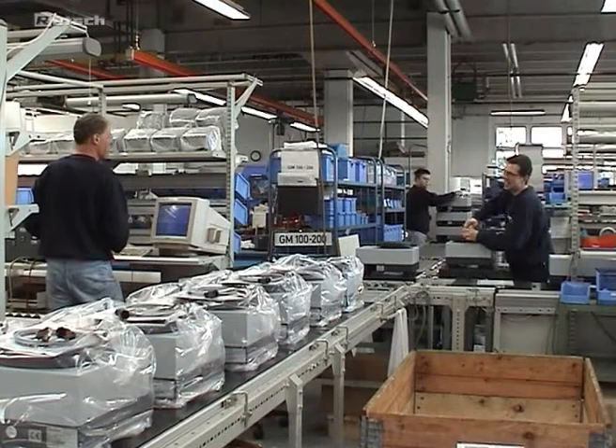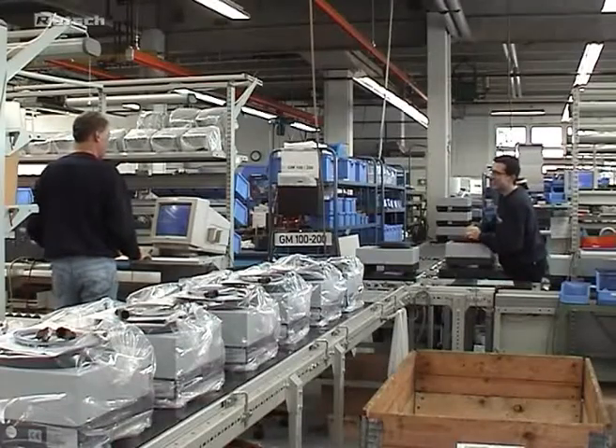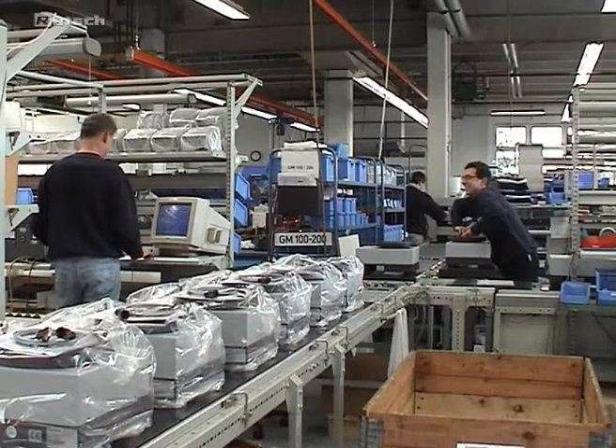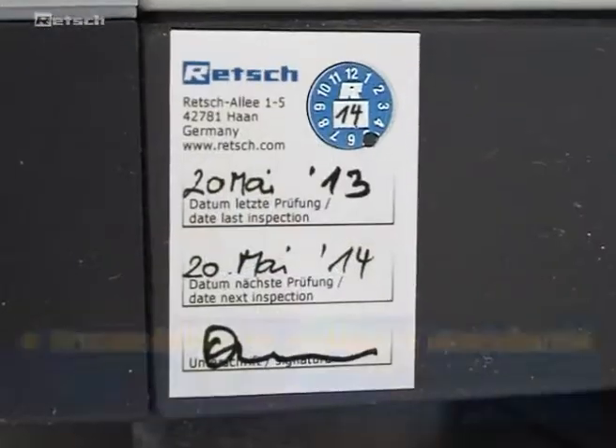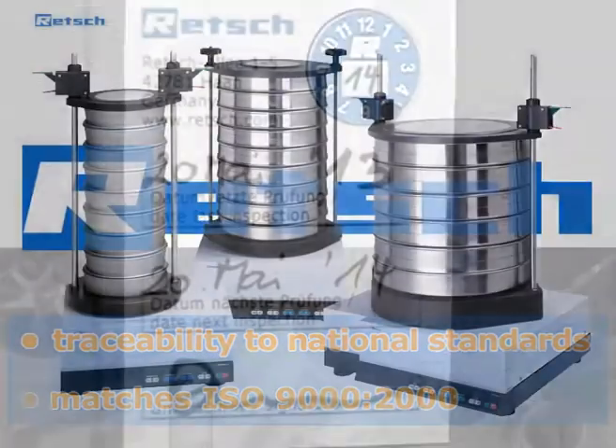The AS200 is calibrated to ensure 100% reproducibility of sieving results not only in one device but among all AS200 control units. Thus, the traceability to national standards according to ISO 9000-2000 is given.